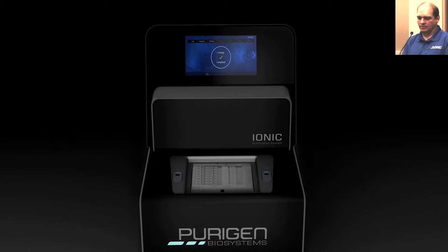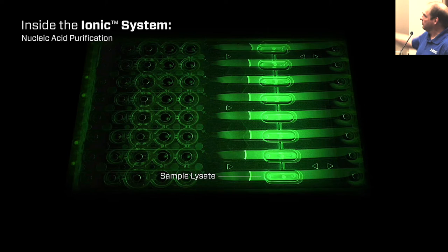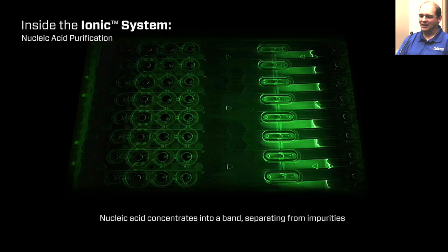So this is a look into the system. All of our chips run 8 samples at a time. I'm showing you an example here. This is dyed genomic DNA. We generally do not have any dye in the system. However, it makes for a great example here.